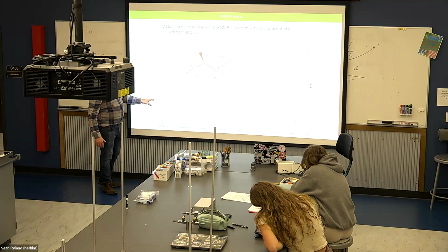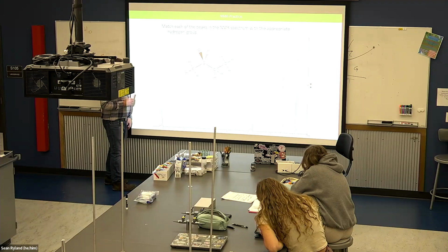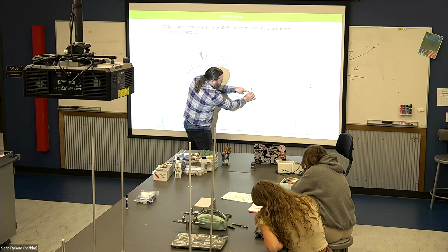So in order, we can think about it just in terms of the smallest integral, and you do the same thing here. And you can literally do this as well if you just use a ruler or the side of your pencil. This one very clearly looks like 2.